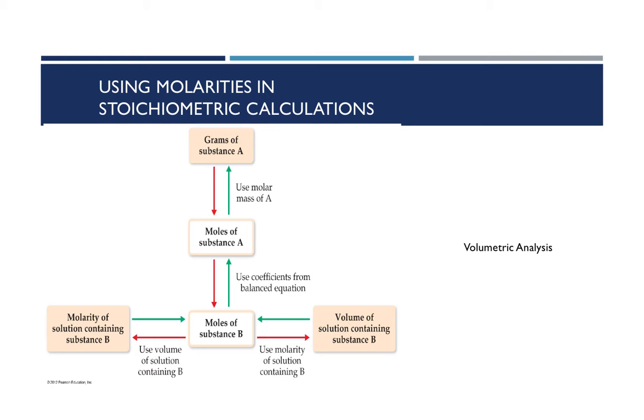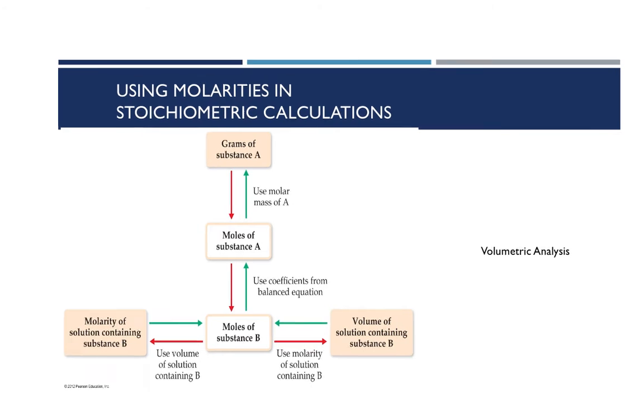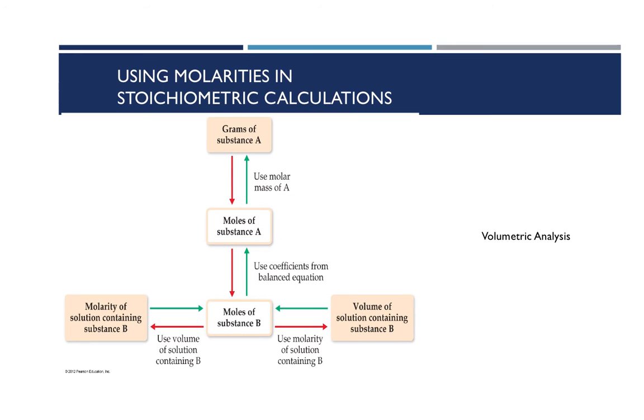All right, so when we talk about titration, we are talking about a method that is officially known as volumetric analysis, which is kind of exactly as it says, right? We analyze quantitatively things like concentrations, etc., using volumes of solution.